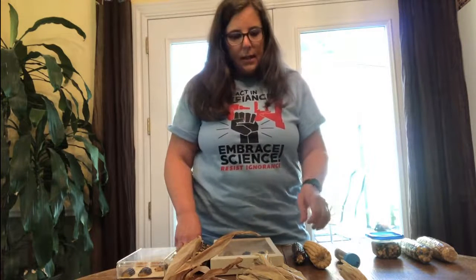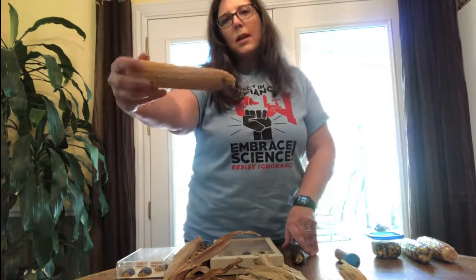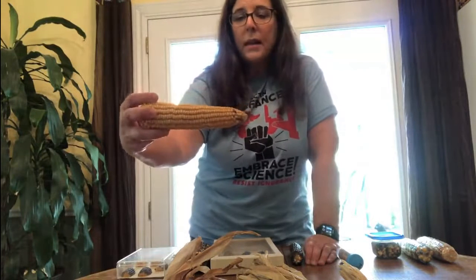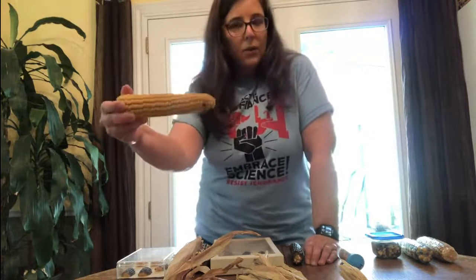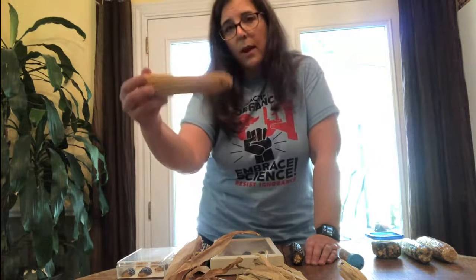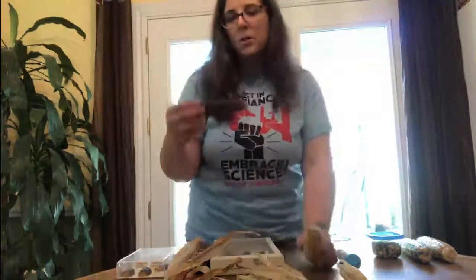Now, this experiment deals with specific phenotypes of corn, and we're going to follow those phenotypes through both monohybrid and dihybrid crosses. So, for example, we are using a corn cob that is a solid yellow phenotype, and this is actually an absence of pigment. The corn that we typically see in the grocery store and eat is a recessive type of corn that has a nice golden color, and so we usually associate corn with that golden color, but that's actually not the wild type of corn. This is a bred phenotype that looks more appealing and corn colored, and that's what people prefer to see in the grocery store.